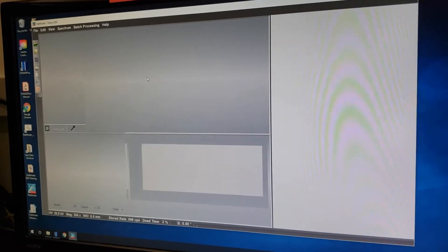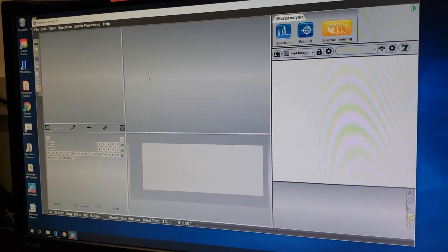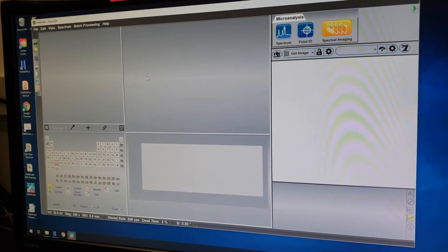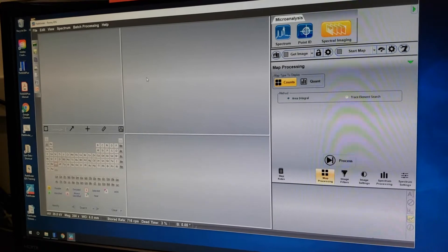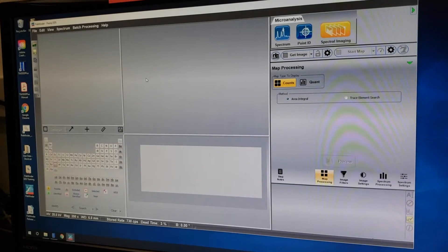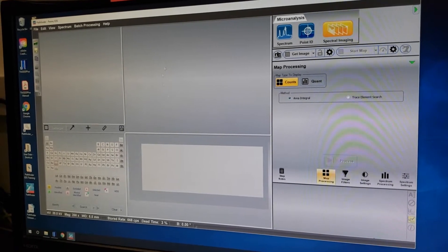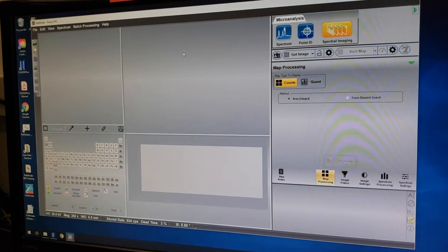Naming it with 'EDS' specifies that this is an EDS Pathfinder project folder rather than some other folder. By calling it EDS, you won't accidentally save files within this folder, which has the potential to throw off our software. You can also open old projects that you've worked on and keep working within those.